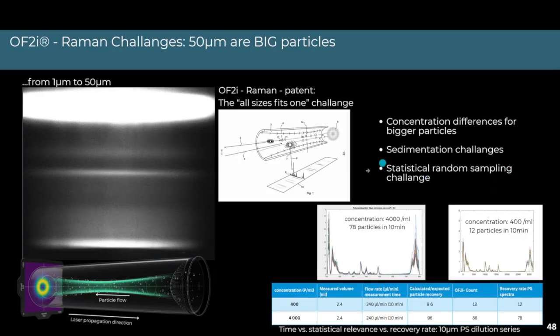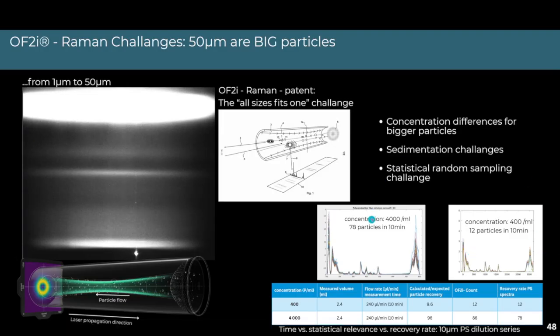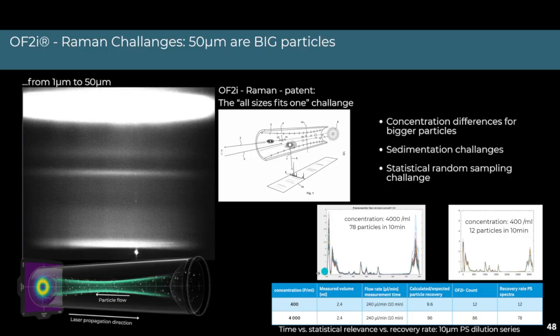And when we do this, we also really need to check how many particles we have, for example at a certain concentration, how many are in there, how many we suspect, because we do not see each and every particle. Some particles also flow up here and are not trapped. So we can calculate how many we are supposed to see and how many we actually see.